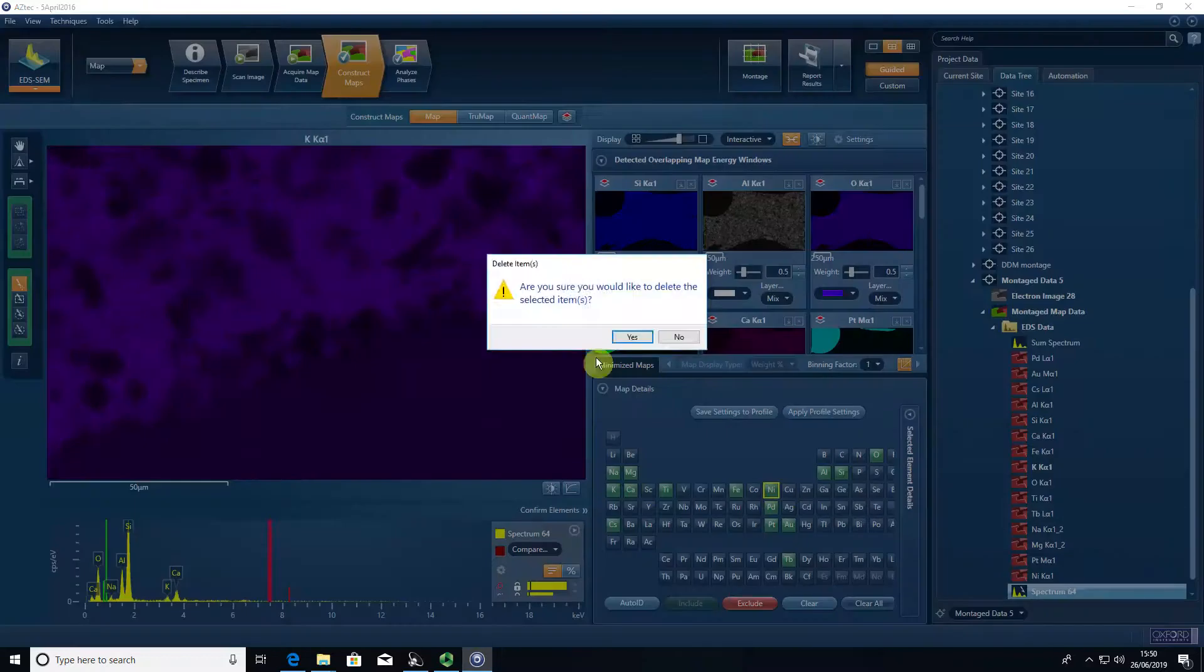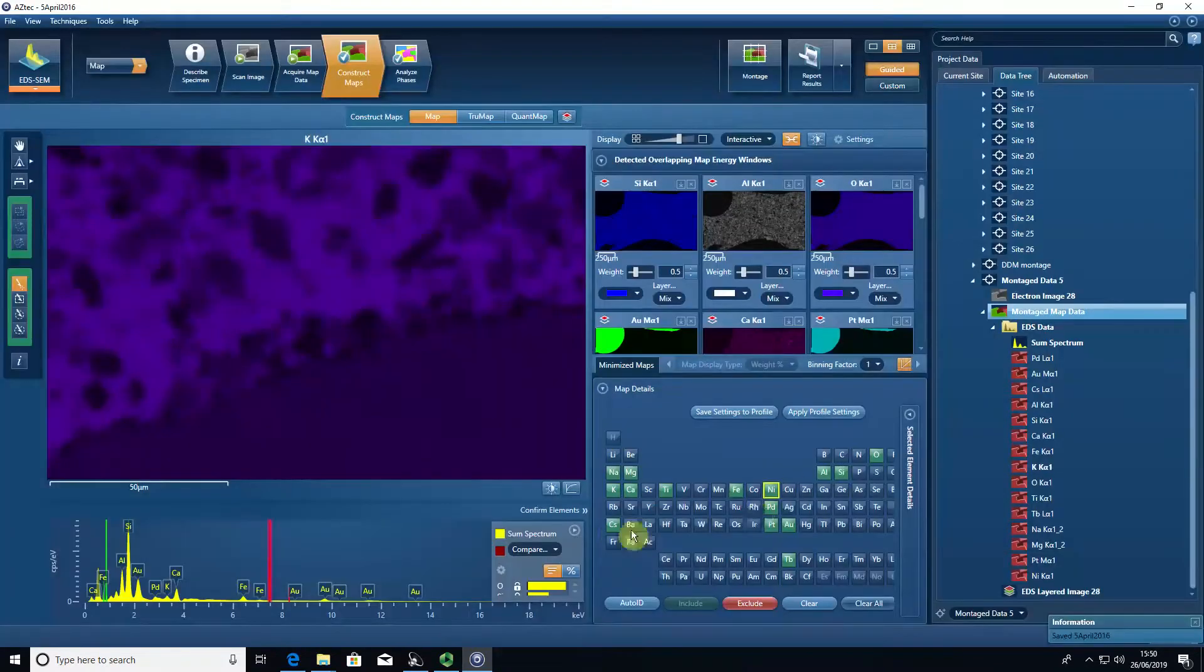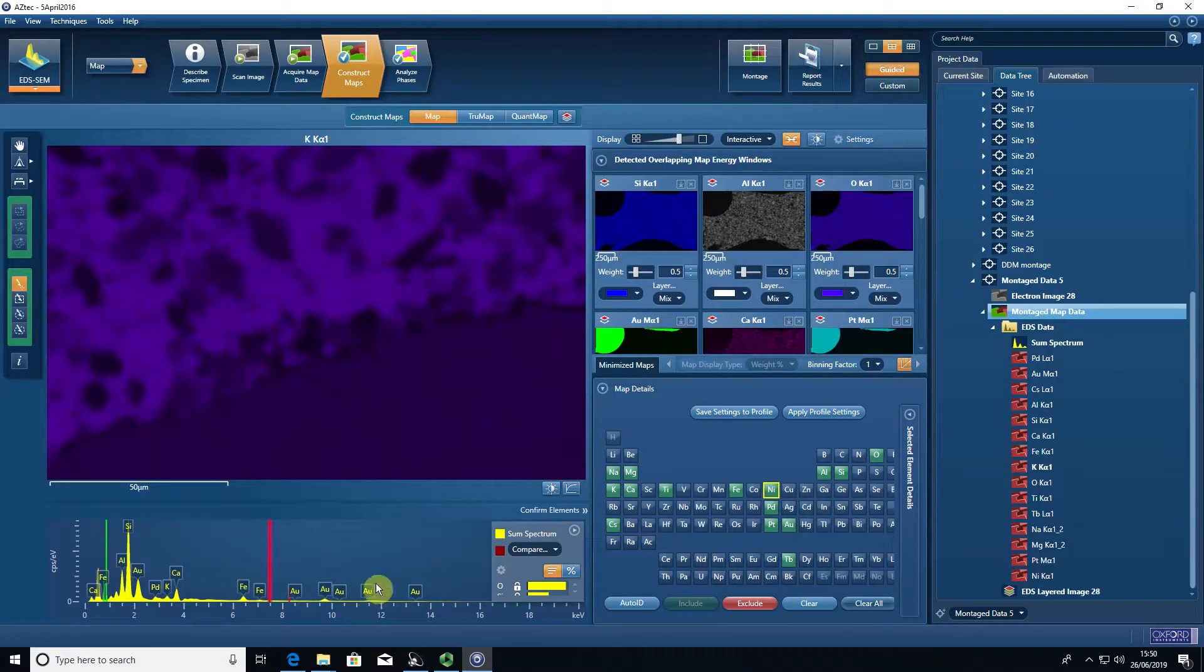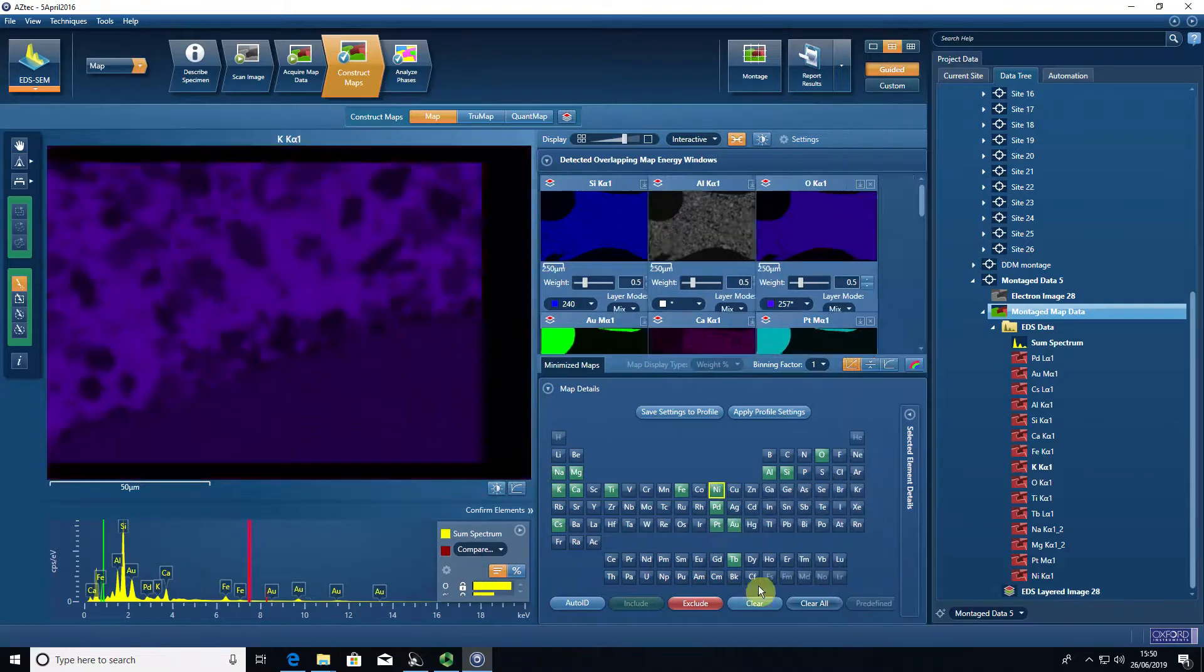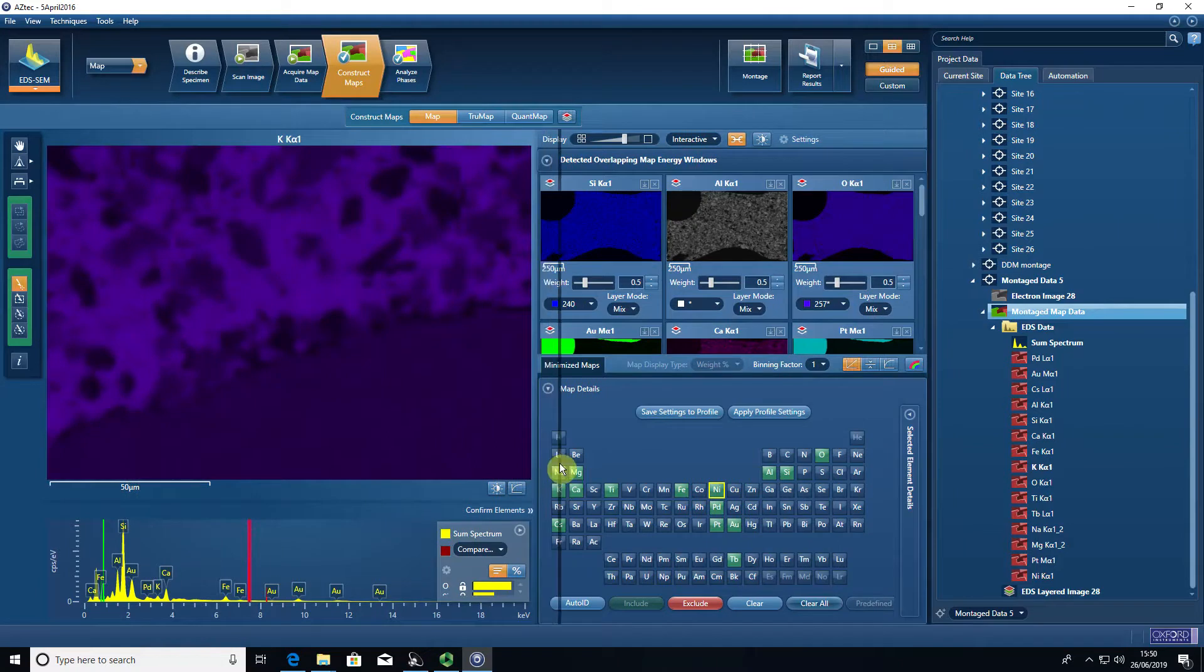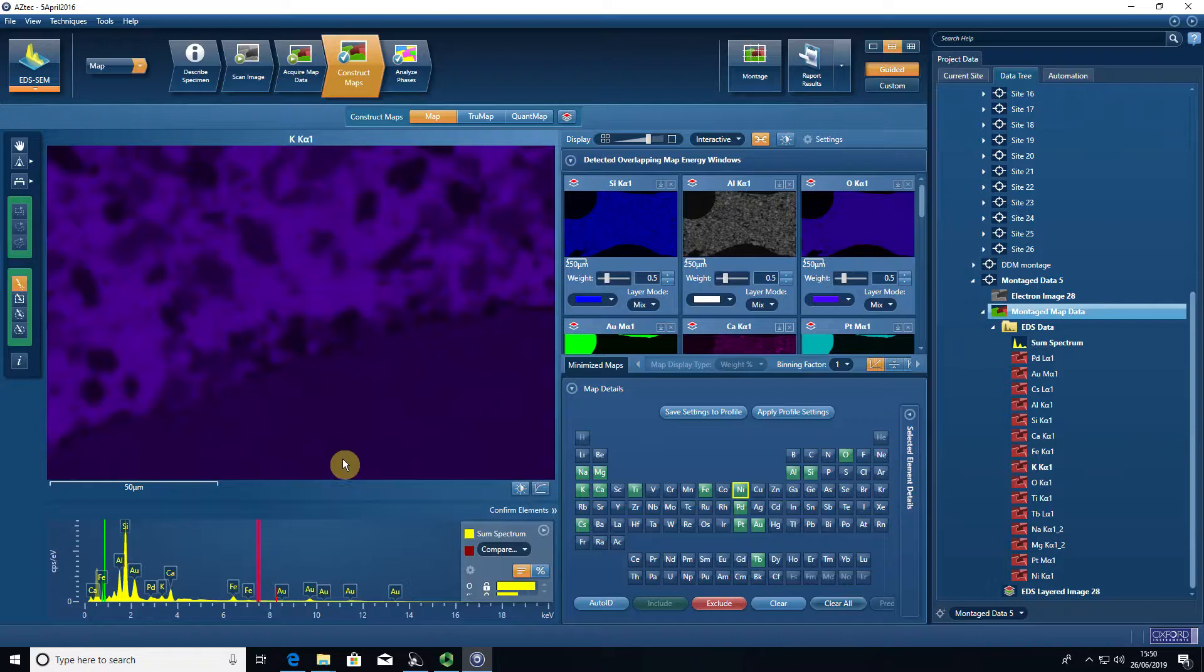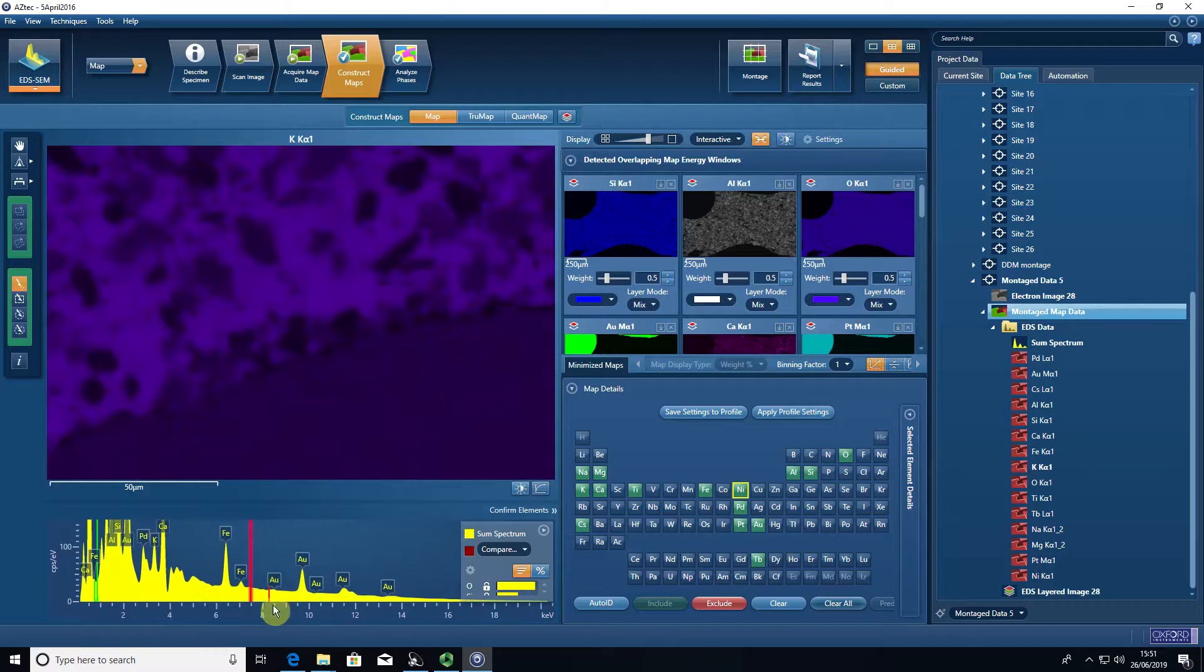We have the option to extract the elements that we want from that data cube. In element mapping, all elements are essentially acquired. If they are present, they will show up in the spectra. But it's up to the person who is processing the data to decide which elements are actually real, which elements are actually present in the sample, and which ones might be being erroneously identified from the auto ID in the software, which just looks for bumps in the background of the spectrum.